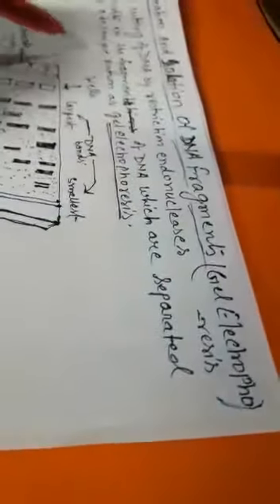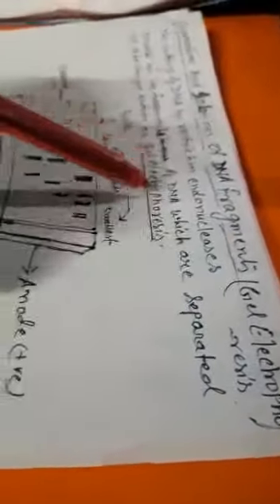Good morning. Today I am going to start the next topic, separation and isolation of the DNA fragments by gel electrophoresis. The cutting of DNA by restriction endonuclease results in fragments of DNA which are separated by a technique known as gel electrophoresis.